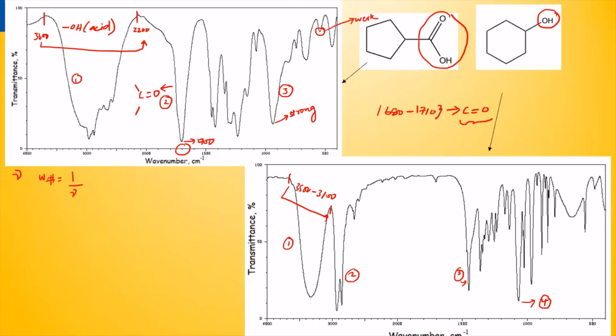Now this one would typically be in most compounds because that's from a CH stretching. If you see, it's around 2900 to 2800, right around there. This tooth-like looking thing, it looks like a tooth, right? And this is usually a CH stretching. This is almost present in most molecules. It is here, but you can't see it because this peak is so big, it's kind of overlapping on top of that. It's like an eclipse, you can't see it.